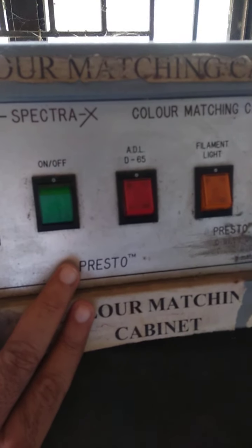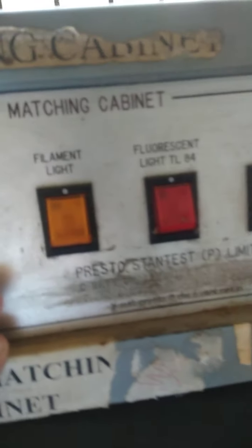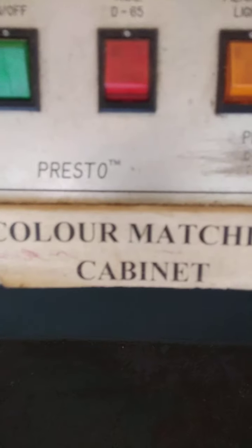After the water baths and serological bath, you have a color matching cabinet — a testing equipment for light. It has on/off switches, and the light sources include artificial daylight ADL D65, fluorescent light, filament bulb light, and UV light. This color matching cabinet is used for matching shades, as the same shade appears in different tones under different light sources.